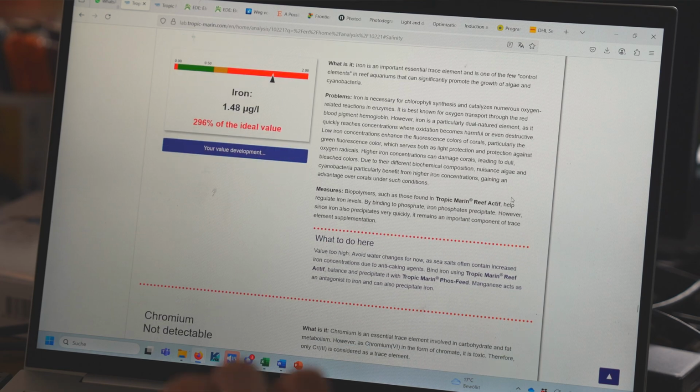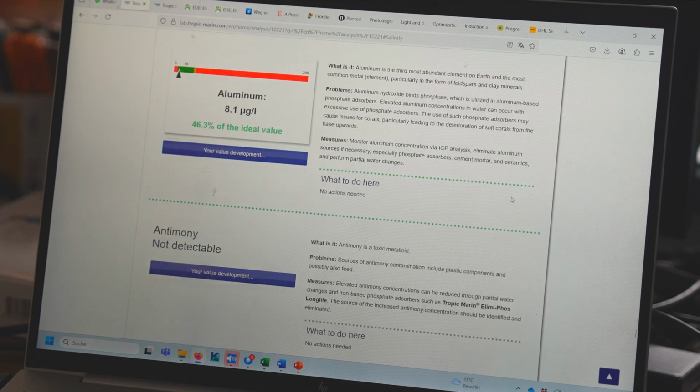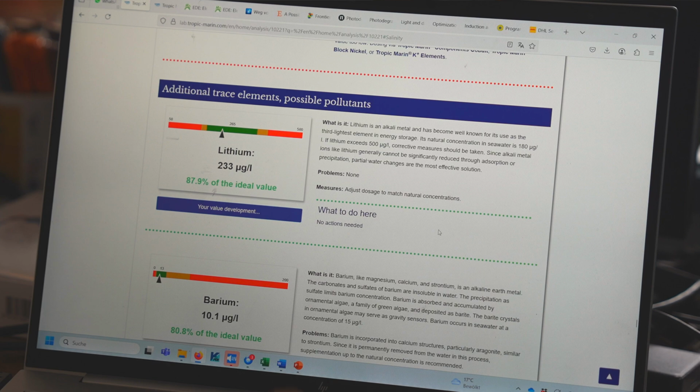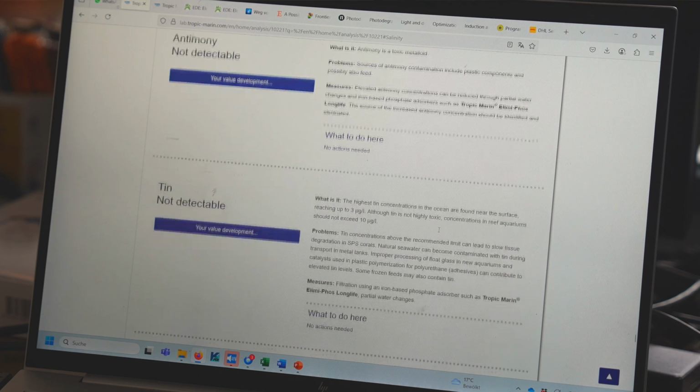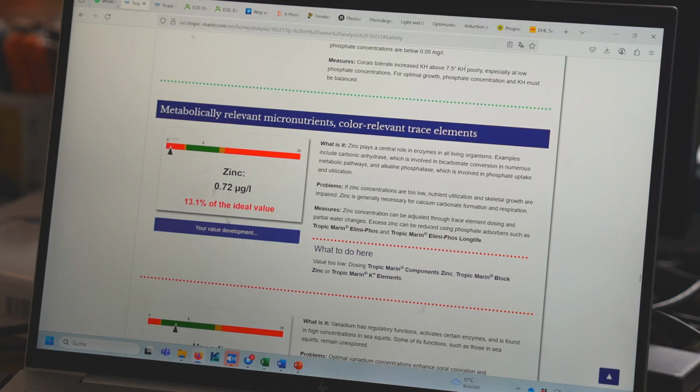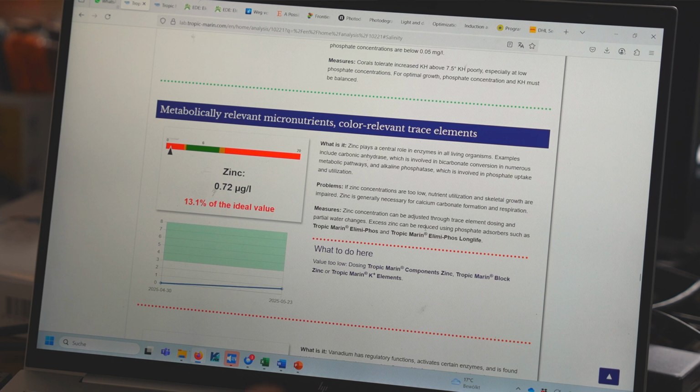All right, so we're down to the additional trace elements and possible pollutants, and ideally for many of them you get "not detectable." And again, a description of what can happen if there's too much in there and what to do. One really cool feature is that you get a curve, a graph of the development over time of a certain concentration. Then you can see whether there's a buildup or a depletion happening over time.